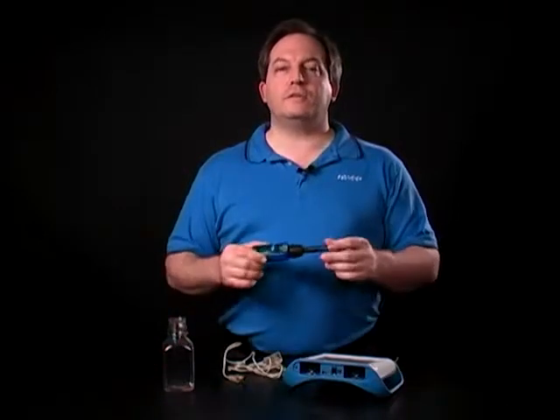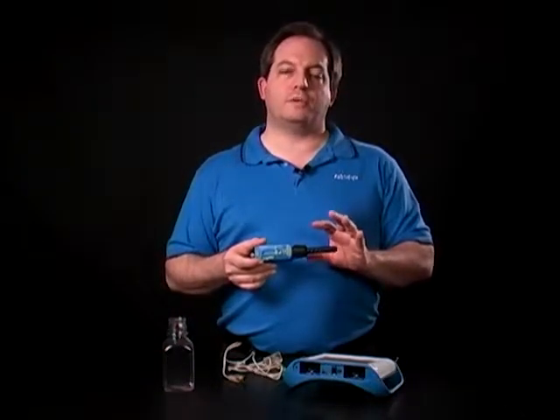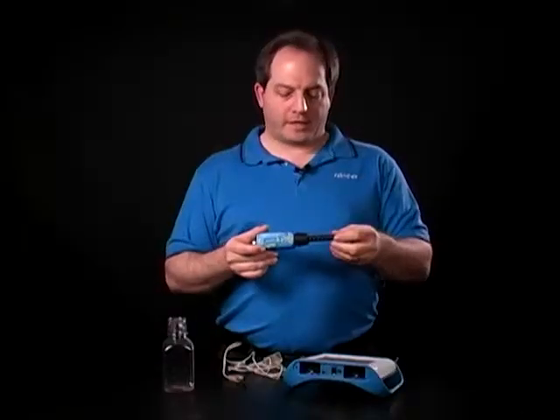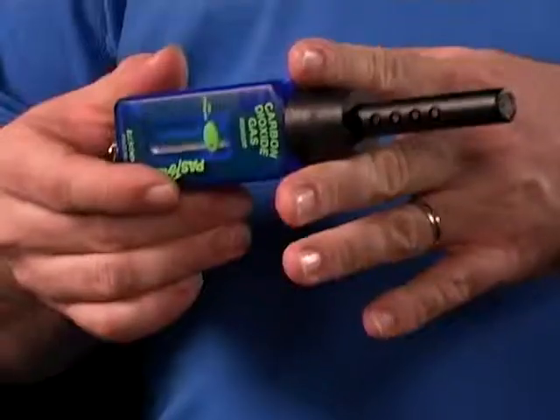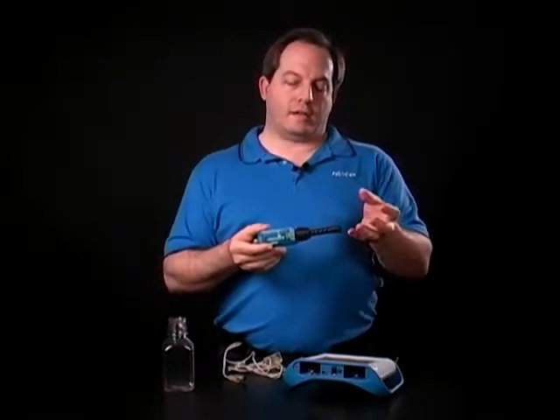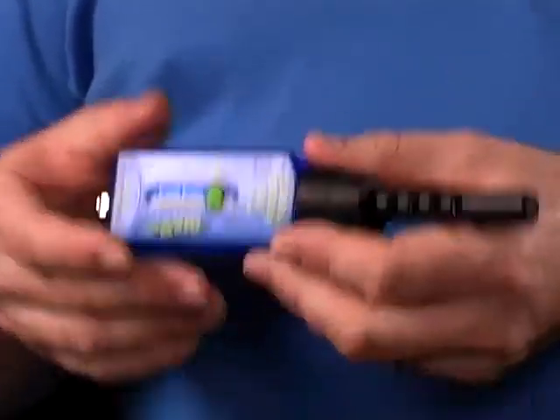Hello and welcome to this quick look at the CO2 gas sensor. The CO2 gas sensor measures the concentration of CO2 in the air as it passes through the snout — you can see the holes here for that. At one end of the snout, a light shines about once per second. It passes through the snout to a narrow pass filter, and through that filter to a thermal pile at the far end. The thermal pile measures the amount of light coming through at that narrow range, and the CO2 passing through will absorb some portion of that light — that's how we get the concentration of CO2 in the air.